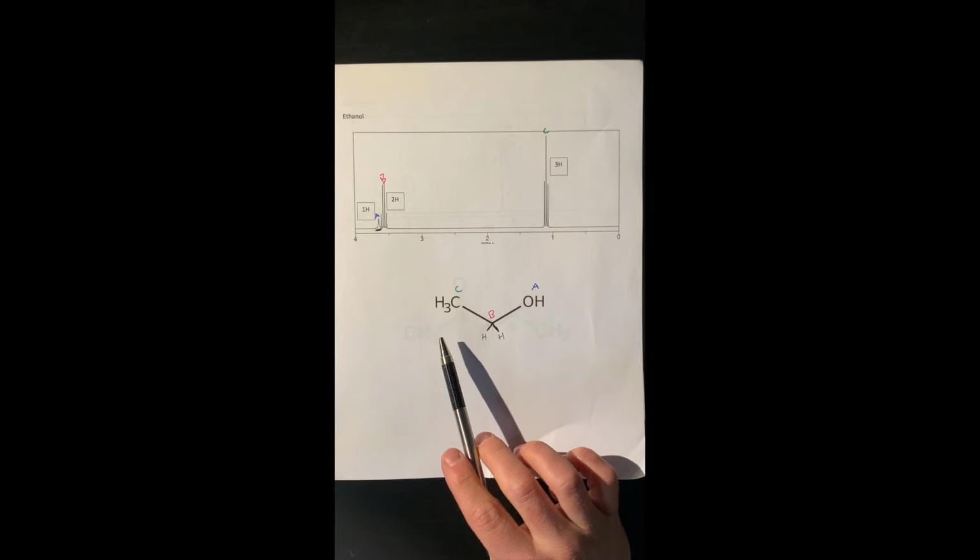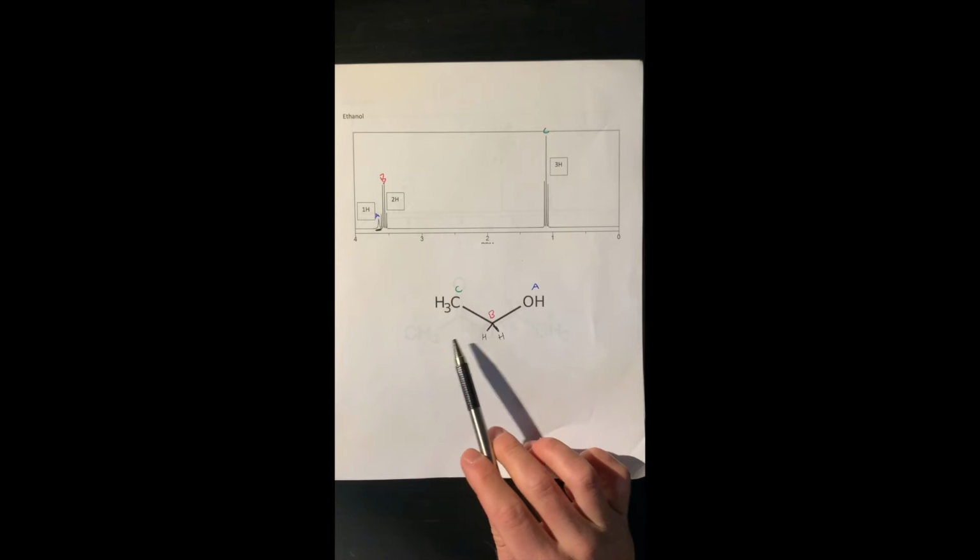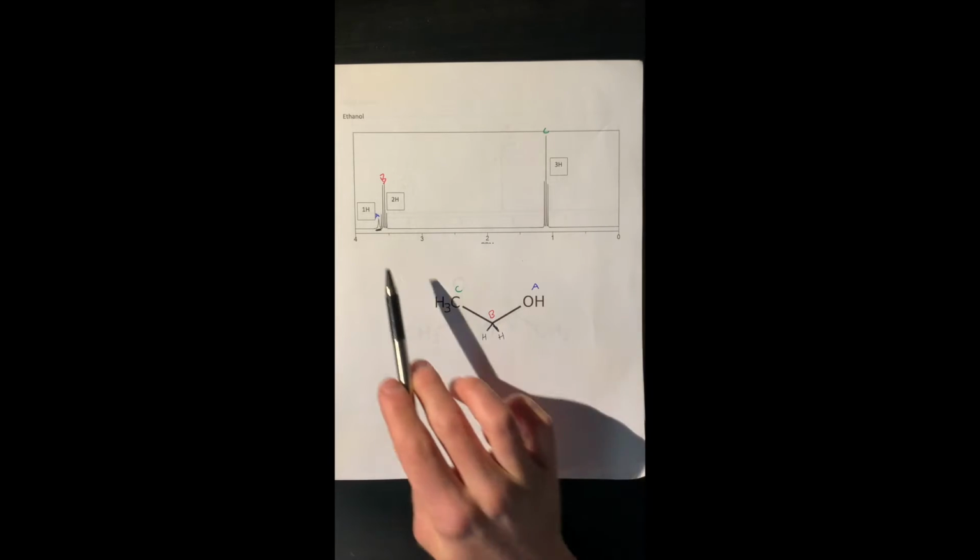Now this is where the placement of the signals comes into play a little bit. The CH3 triplet will be the closest to 0 ppm, also known as the furthest upfield. So this is upfield, that's downfield. This is because it's the furthest from the electronegative atom, which in this case is oxygen. As you can see, just above 1 ppm, maybe like 1.1, 1.2 ppm, there are 3 peaks next to each other, and it's a triplet.